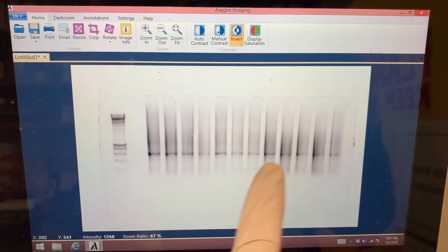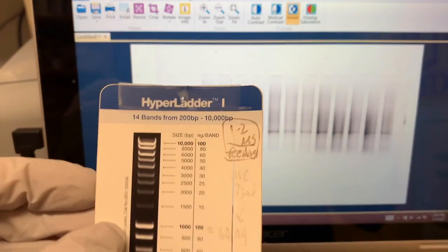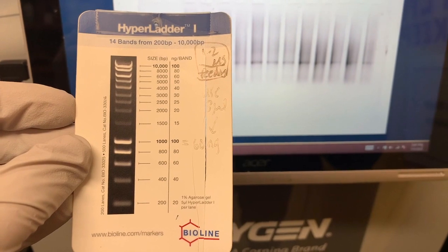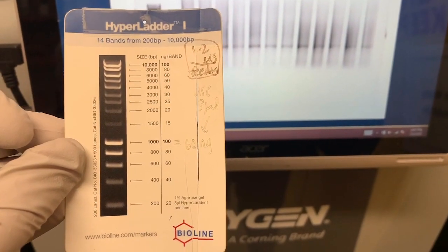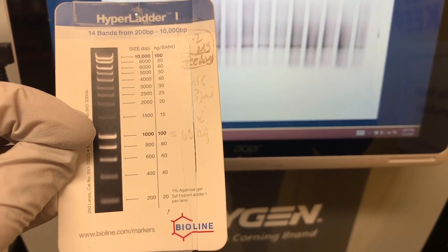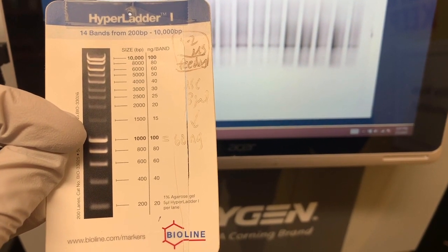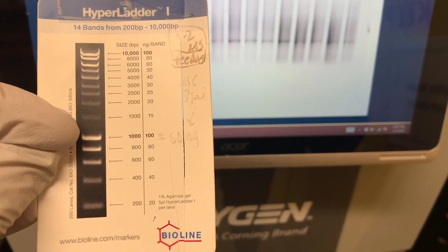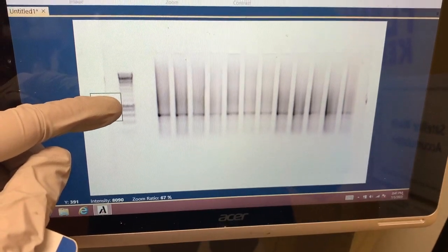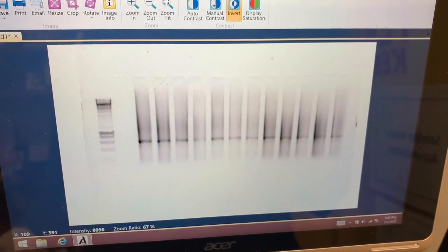And then my samples, each one of these is 1 microliter of 1 to 10 dilution. And you can look up one of these ladder information cards online. This is just one that came with one of these tubes a long time ago, but you can find this online, and you can see that this bright band at 1 kb, there's 100 nanograms of DNA in this band if you load 5 microliters. I loaded half that, so this bright band right here is 50 nanograms of nucleic acids.